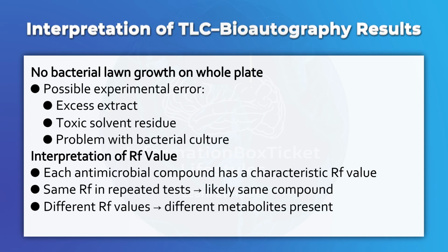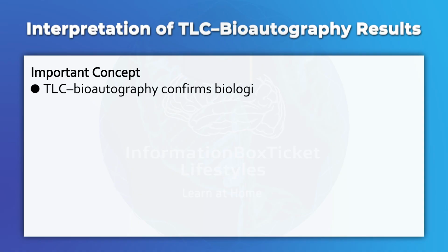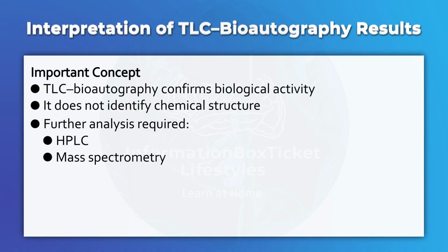Different RF values lead to different metabolites present. Important concept: TLC bioautography confirms biological activity. It does not identify chemical structure. Further analysis required: HPLC, mass spectrometry, NMR spectroscopy.